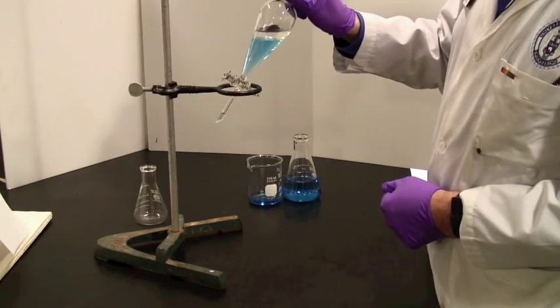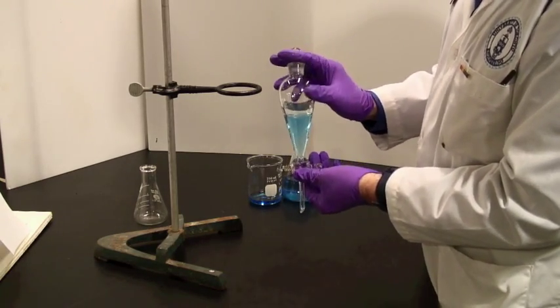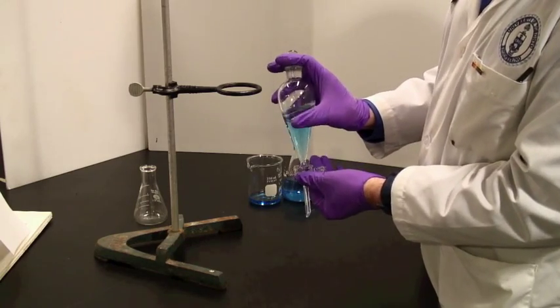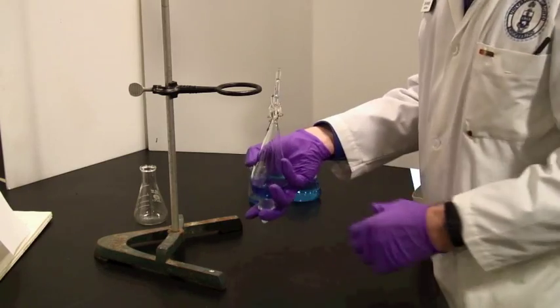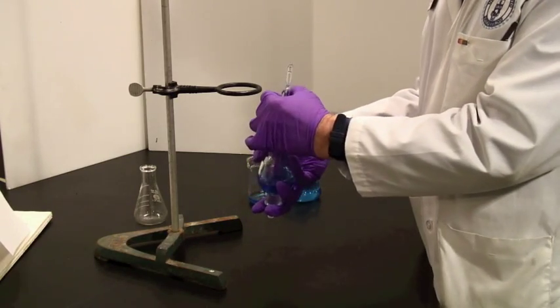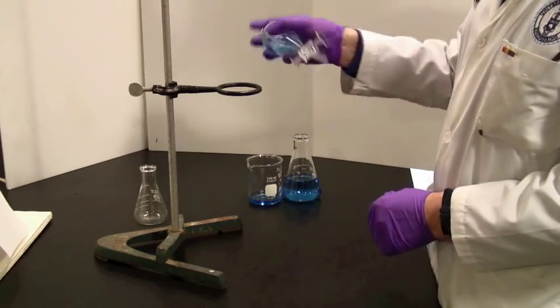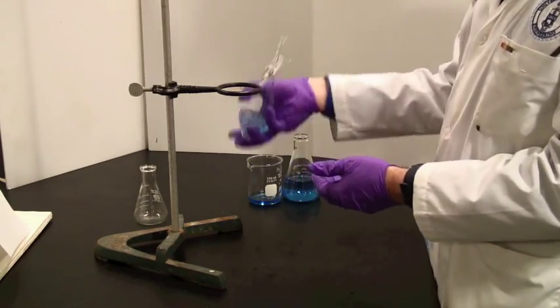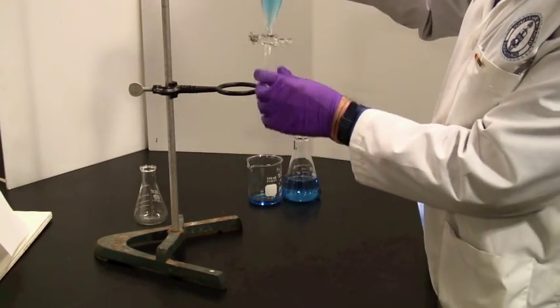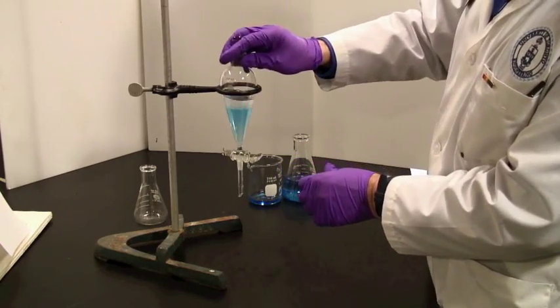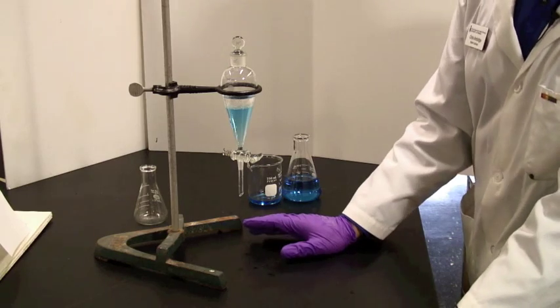Take it out of the clamp stand. Make sure that you are holding the cap on with your fingers. Invert and immediately open the tap because doing that will cause a pressure increase. Close the tap again and then invert a few times to make sure that everything mixes properly and place back in the ring stand to allow it to settle. This may well take a while.